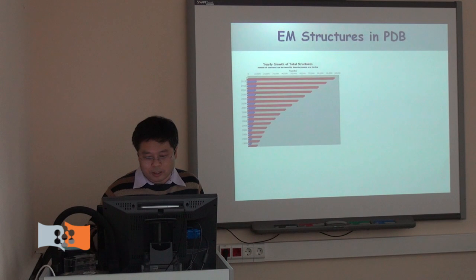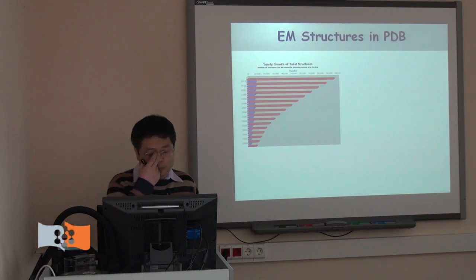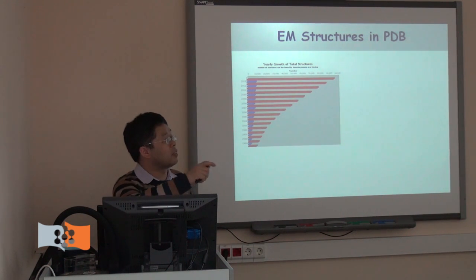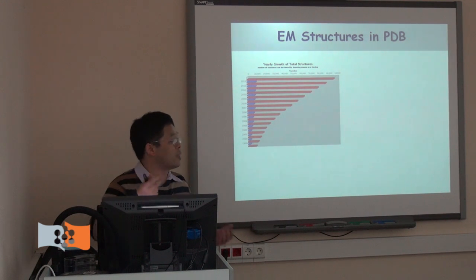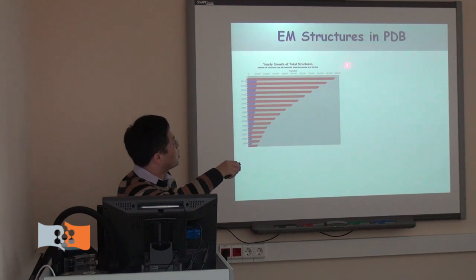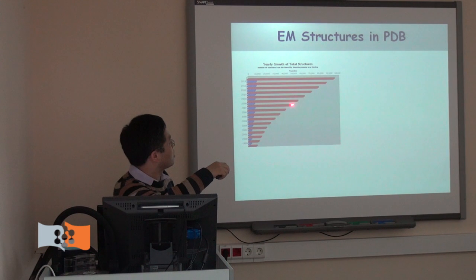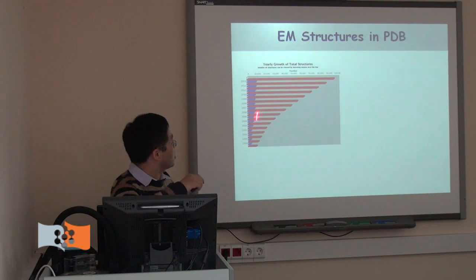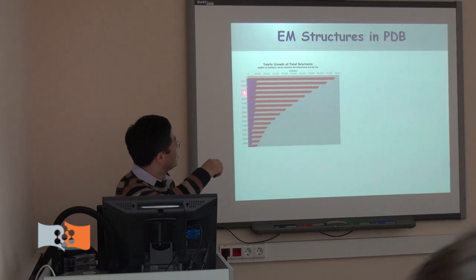So basically, in the structural biology field, there is what we call the PDB. That's where the solved structures go: for how many structures are solved, we deposit the coordinates into the database. You can see the trend, it is increasing. The structures deposited by the whole world in structural biology keep getting more and more, though it should be stable in recent years.